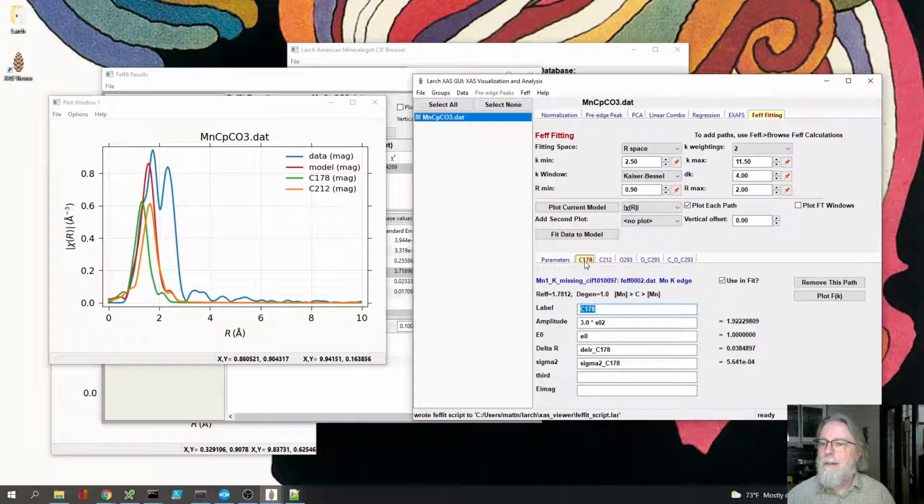This is the carbon of the carbonyl. This is the oxygen of the carbonyl. I'm just going to assert that there are 3 of those. Actually, I should probably assert that there are 6 of those, because it can go from the oxygen to the carbon and back, or from the carbon to the oxygen and back, and they're pretty much the same. So I'll assert that there are 6 of those, and then for the carbon, oxygen, carbon, there are 3 of those.